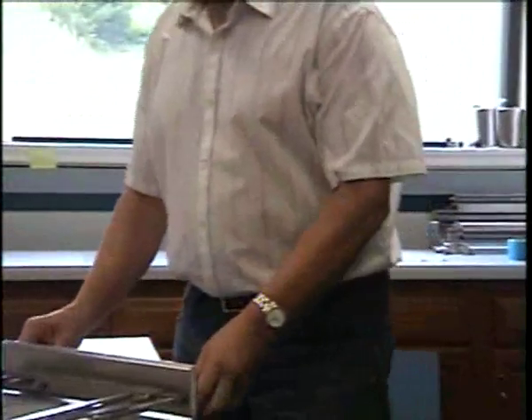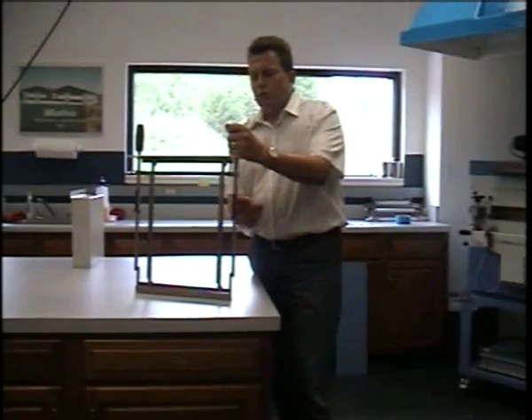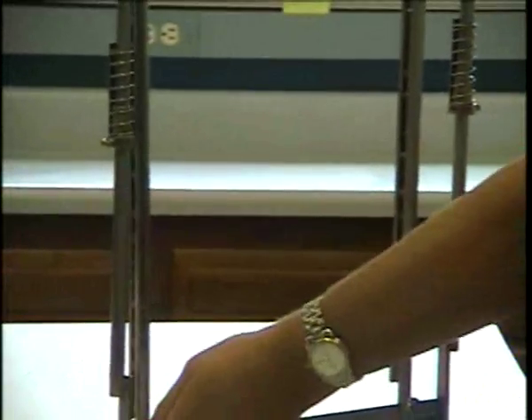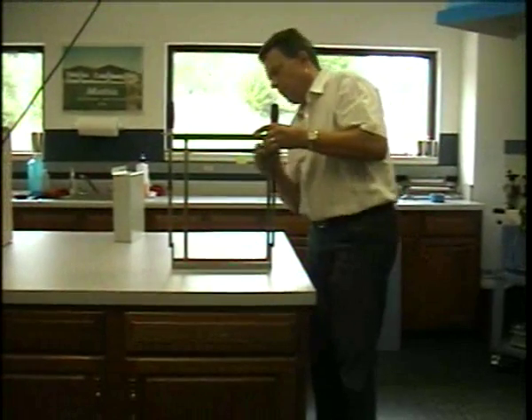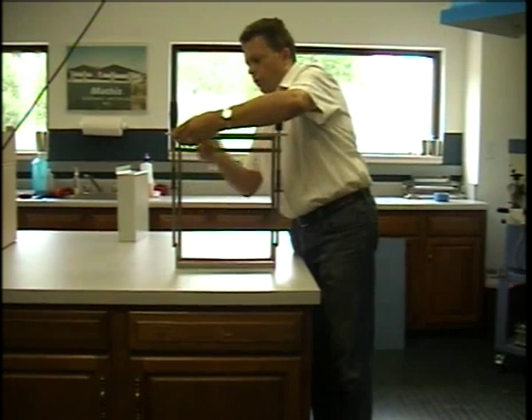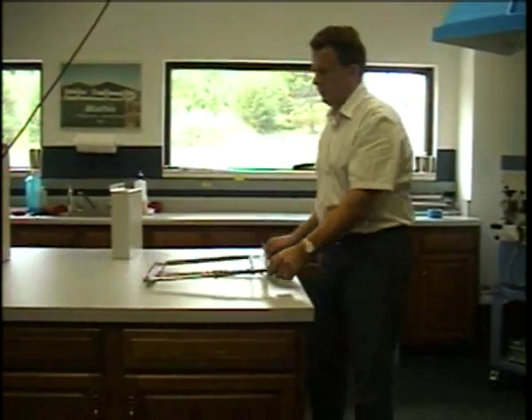Now for coating, it is important to remember that the side rails, these are the side rails, have to be all the way to the outside. So what we do is we have knurled screws for these side rails, and we can loosen these, and then we'll move it all the way to the outside. So it's parallel to the rod here. Same thing on the other side. And this is important to have them all the way to the outside because our coating roller will fit in between. So I'll leave this here for right now.